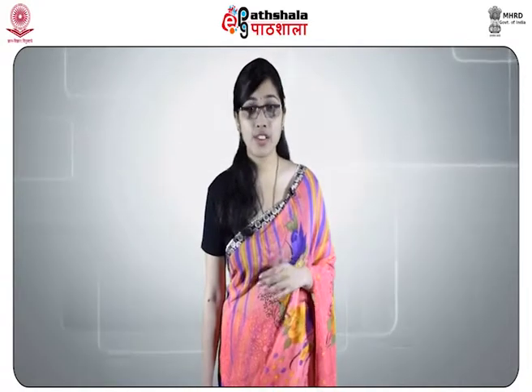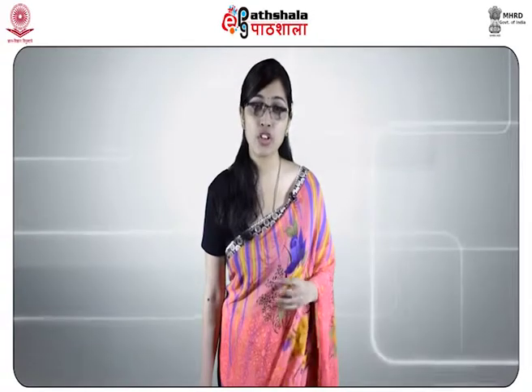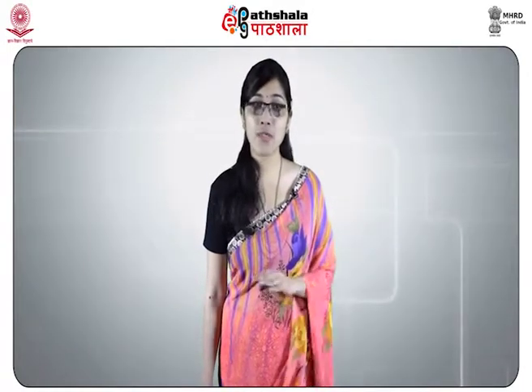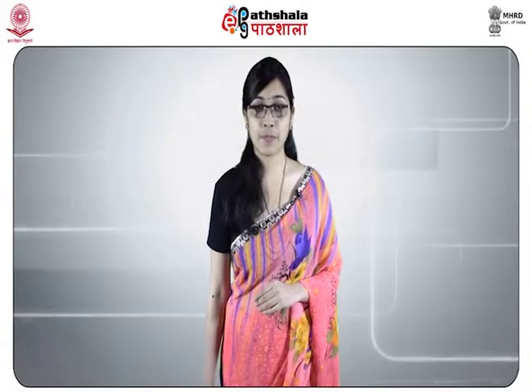Although certain hairs can be attributed to a species, it is not possible to identify hairs to a specific animal to the exclusion of other similar animals. Presence of a small amount of debris or blood on hair may not interfere with the microscopic examination. Cleaned and washed hair should be dried before mounting it.